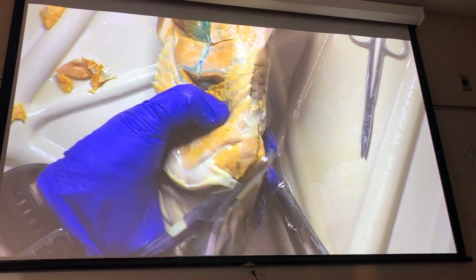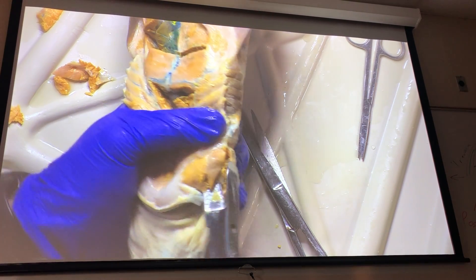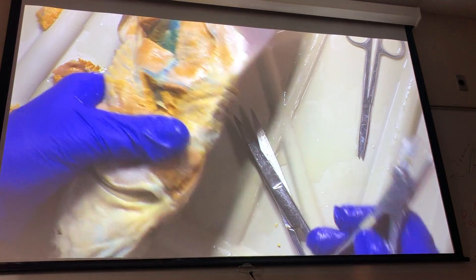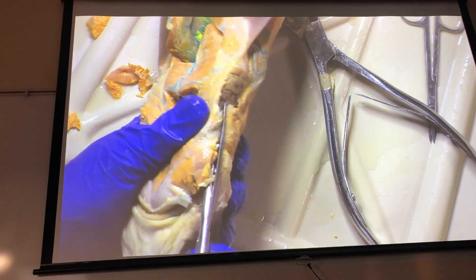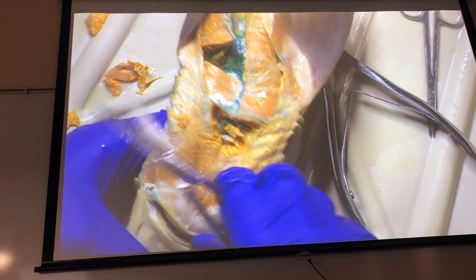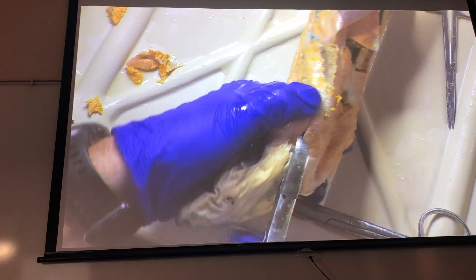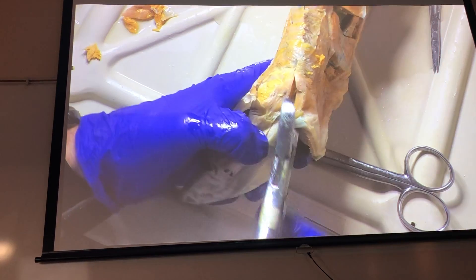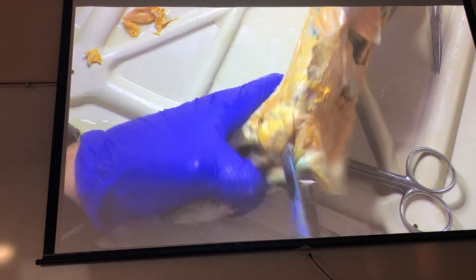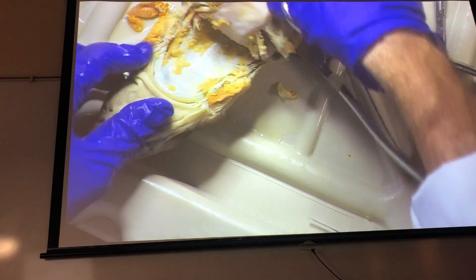There's nothing pretty about this. You've got a crunch there — it's just like eating pork rinds, probably just as healthy. I'm going to do the same thing on the other side. These bone clippers will sometimes break on you as you're going, so if that happens you just have to put the arms back together again. And then there it is, opened up.